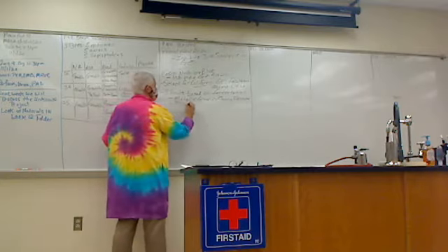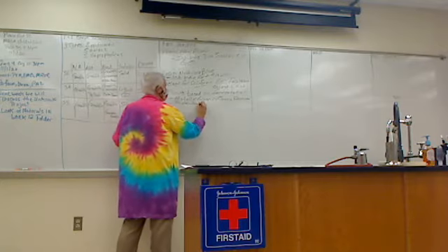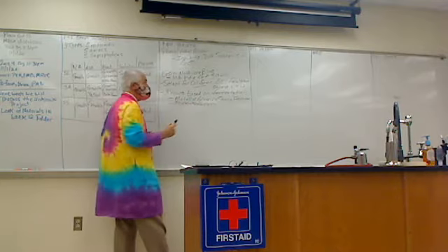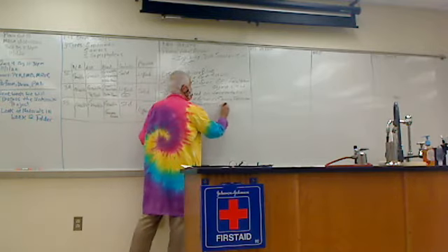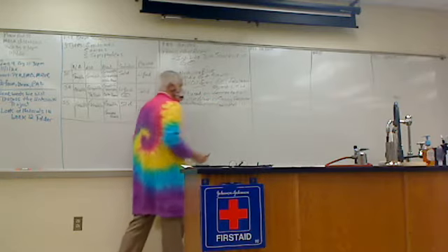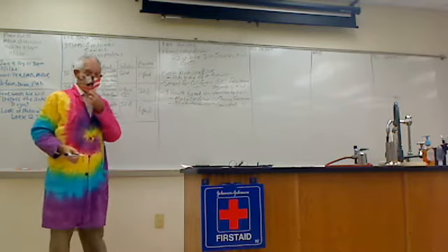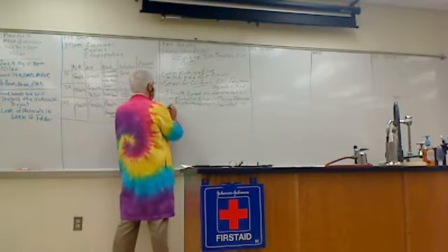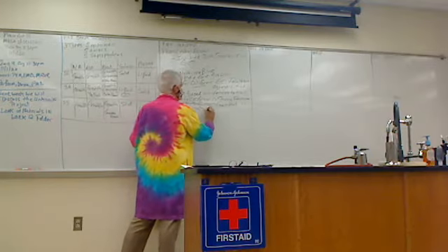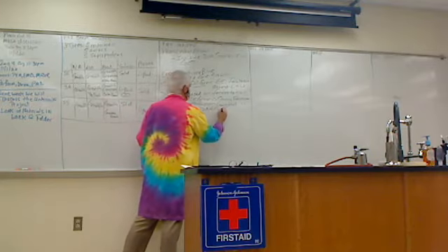A pink to purple color, and that would be if you have a low to moderate fermenter. And the last type, guys, no color. And that would be a non-fermenter.